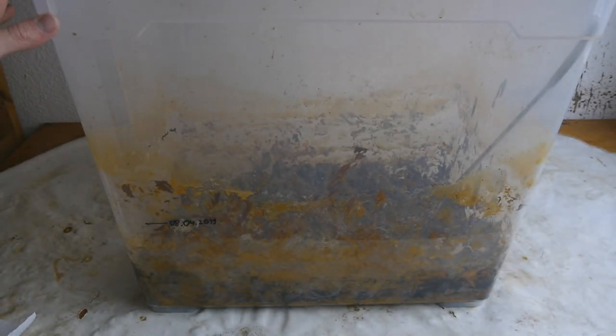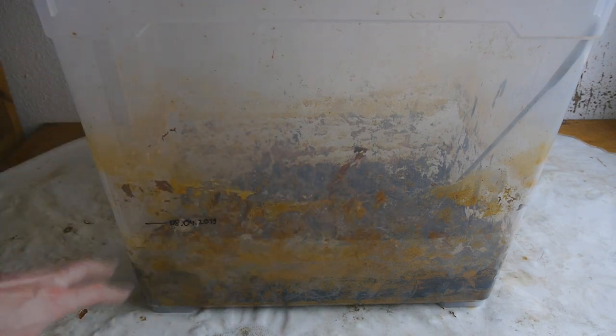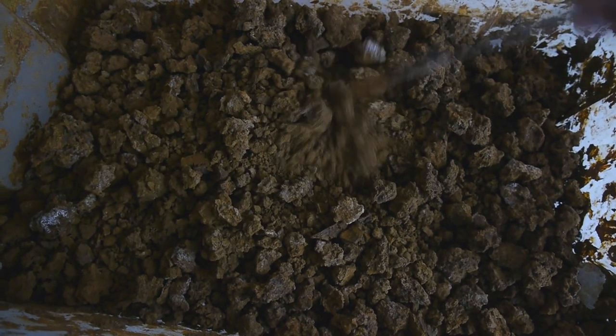Here we are now with everything completely dried up. This is how much volume the iron oxide was taking up before it was dried. And now that it's dried you can see that it is a lot less. It took about 3 months to dry up. Here you can see everything.